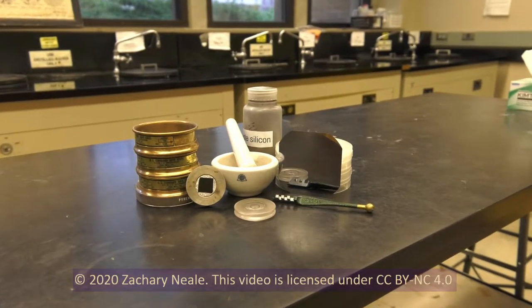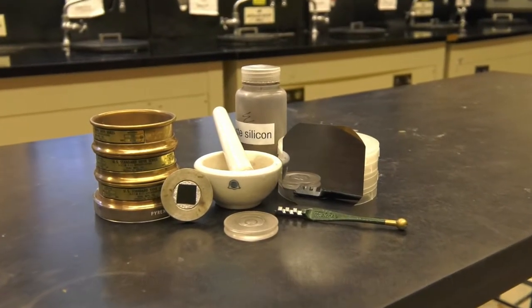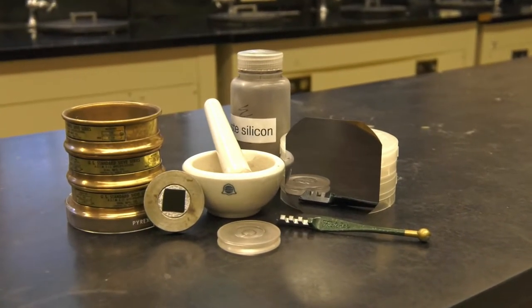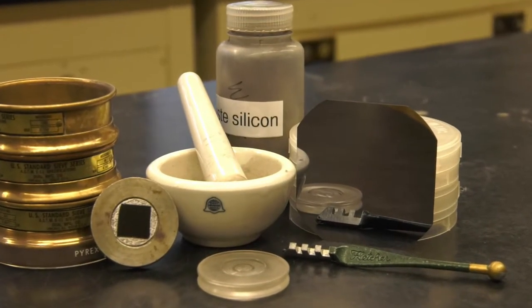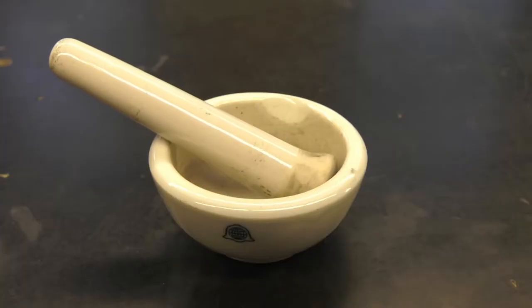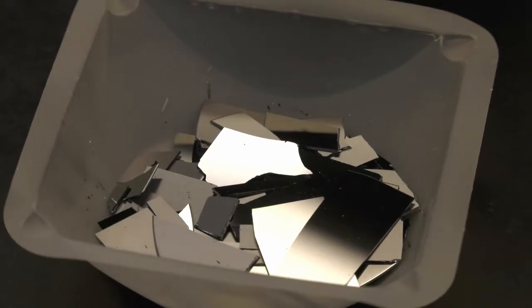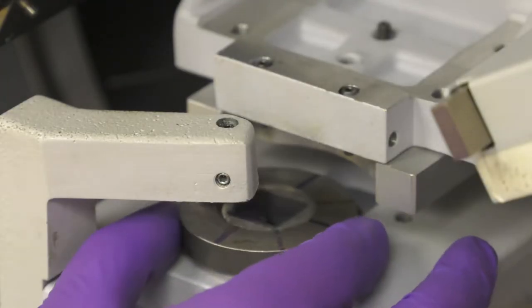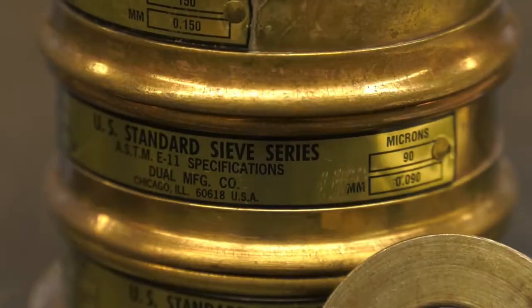Silicon is a key component of the semiconductor industry and is the precursor to many semiconductor devices. Single crystal silicon can be produced through the Czochralski method, from which silicon wafers can be cut and polished. This experiment will investigate how particle size of crushed single crystal silicon will influence the diffraction pattern of XRD characterization. This will be done by crushing and separating silicon powder using sieves of different sizes.